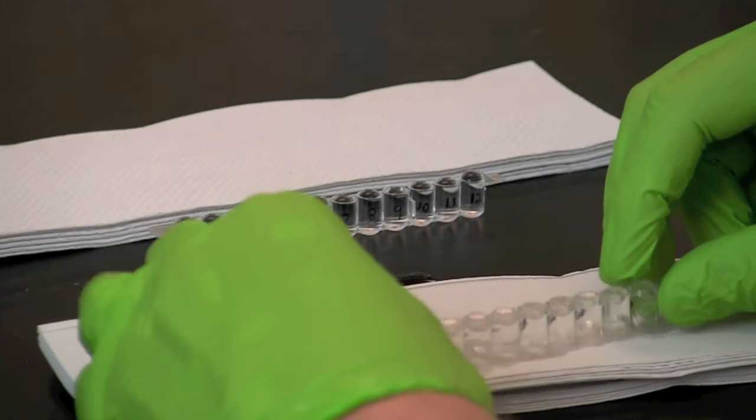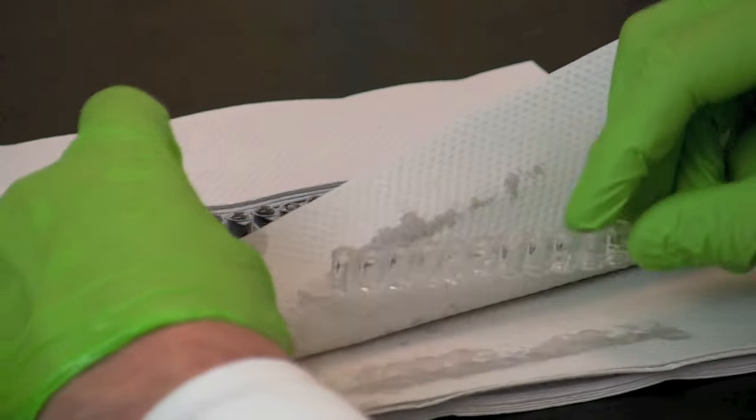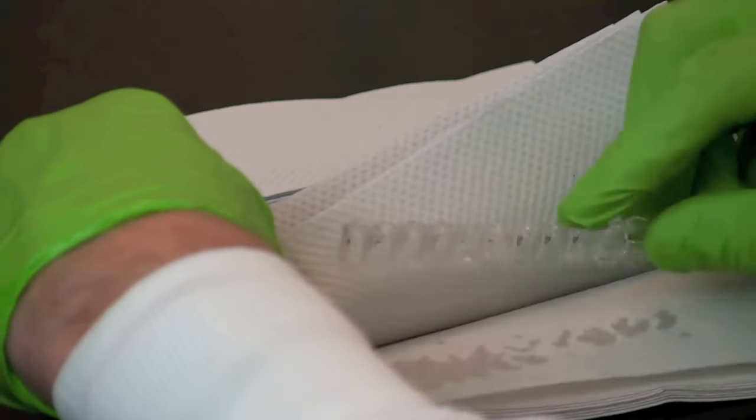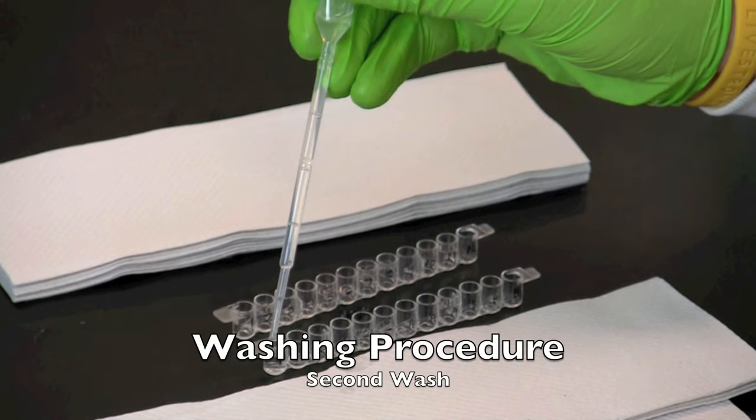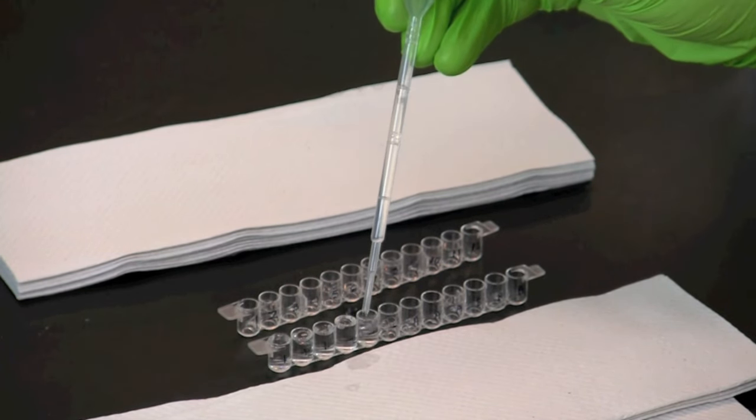Tip one of the microplate strips upside down on a short stack of paper towels and gently tap the strip a few times. Repeat this process with the second strip. Repeat the washing steps one more time for both microplate strips.